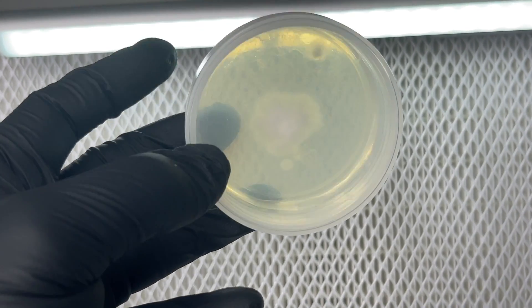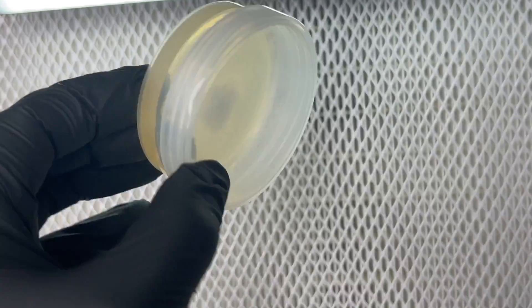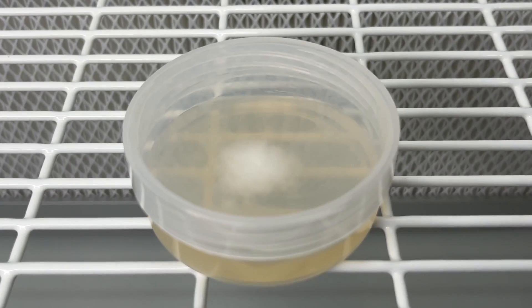I've been using these plastic twist-top containers that can withstand the pressure cooker. With them having a twist top I haven't had to use parafilm to wrap the edges and it seems to have enough oxygen.